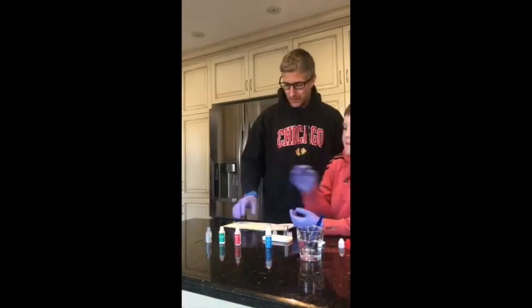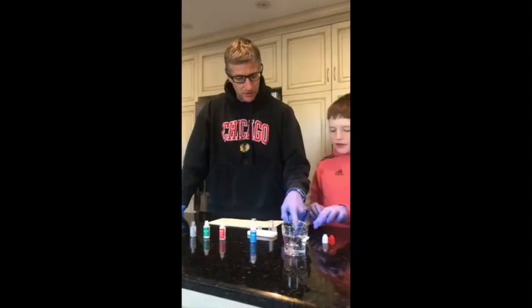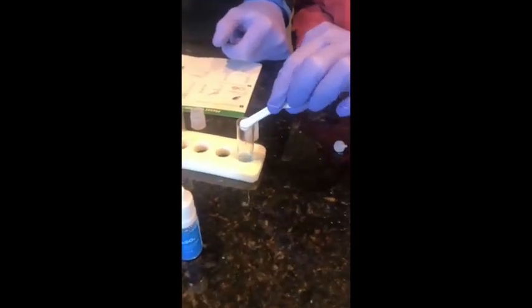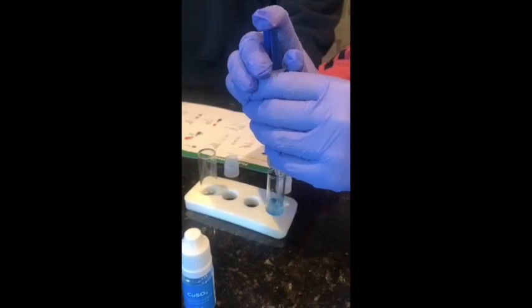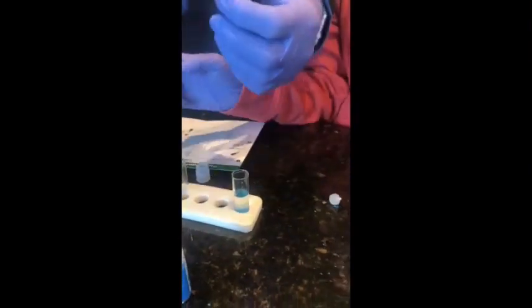Okay, so the first step we're going to do is we've measured it out, we've got some copper sulfate, and we're going to gently pour it into our first test tube. It's empty. That's why we have gloves on, because it's spilling a little bit. Okay, put it down on the table. And then we're going to take 4 mils of water and put it inside. There's 4 mils. That's awesome. Thank you, Duncan.